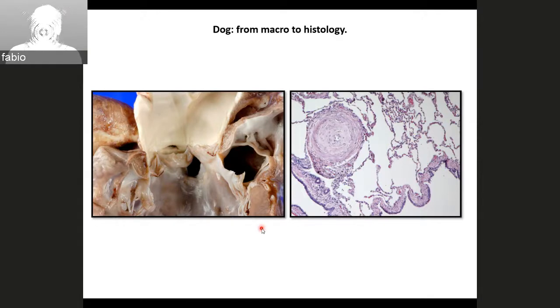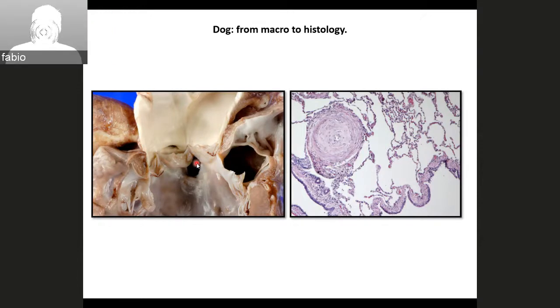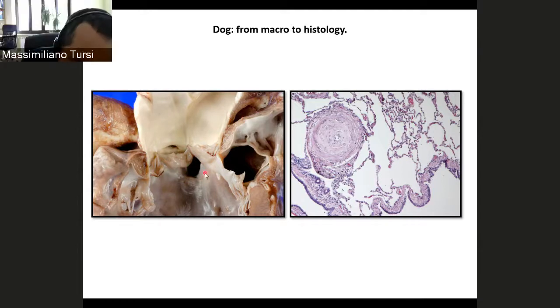Okay, there is more they need to describe. Which is the diagnosis? That would be a ventricular septal defect, perimembranous maybe. Membranous, perimembranous. Yeah, I agree. Because here there is a small whitish triangle area. That's the membranous, but it looks also around.